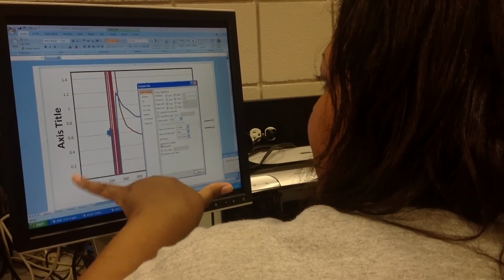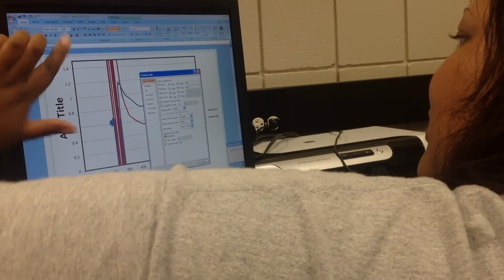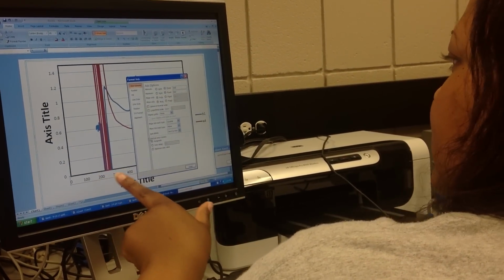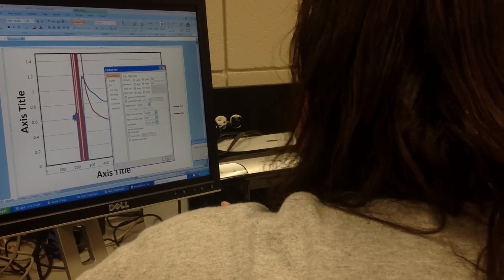Depending upon what your styling is going to be, if there are too many increments in here, you can adjust that here too. You can tell it to reduce the number of increments by doing this in your major unit, etc. So for right now, we're good.